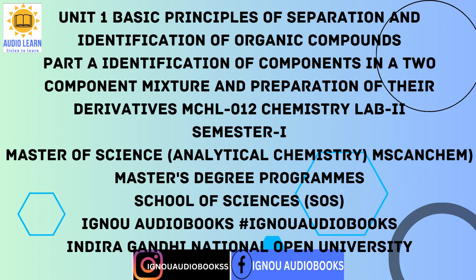1.5 Summary. In this unit, you learnt about the following aspects of separation of components of a mixture of two organic compounds and their identification. In the beginning, we explained the general principle of separation of organic compounds from their mixture, then the separation of components of the mixture after ascertaining their nature as acidic, basic or neutral was explained in detail. The characteristics and tests for different functional groups present in the separated compounds were discussed. Thus, by performing the characteristic tests, the separated compounds could be identified using their physical constants and preparing their suitable derivatives. The physical constants such as melting point and boiling point of the compound and those of the derivatives prepared are confirmed from their literature values to finally identify the organic compounds present in the mixture.